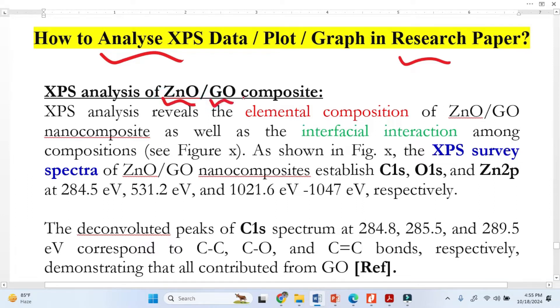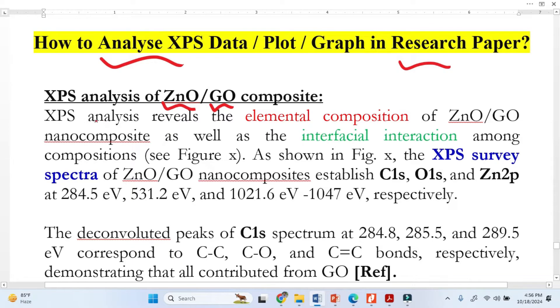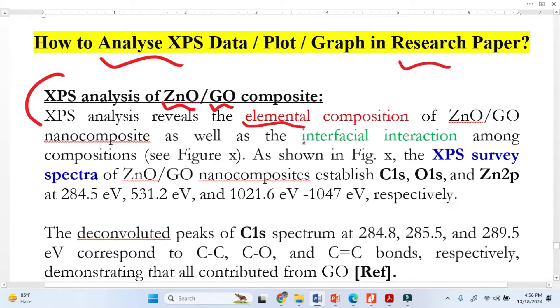In your case it may be a different material, but the interpretation and analysis are the same. In XPS we take two spectra: the first one is the survey spectra, which we use for elemental analysis. The second is the high-resolution spectra.